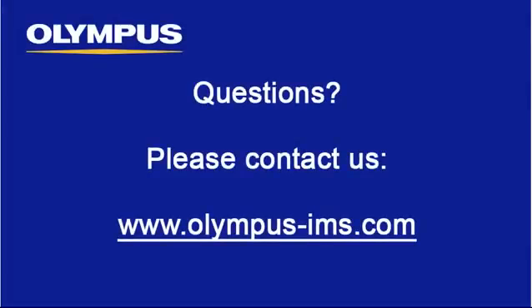In this instructional video, we have covered 3D imaging and measurements within the Olympus Stream image analysis software. We hope this video has been beneficial, and we invite you to contact us directly with any questions.